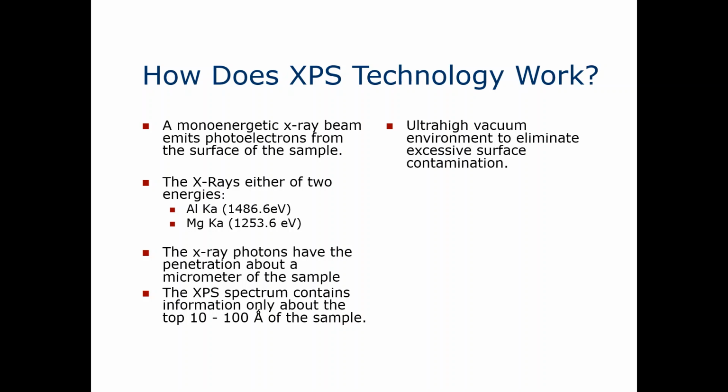You also remember that XPS is basically an ultra high vacuum technique. It needs an ultra high vacuum environment, and the reason is to protect the surface from contamination, from possible impurities. In order to have a contamination free environment, we use ultra high vacuum during the XPS analysis.